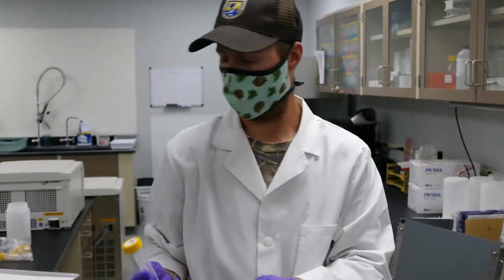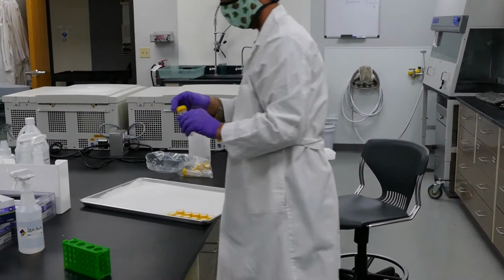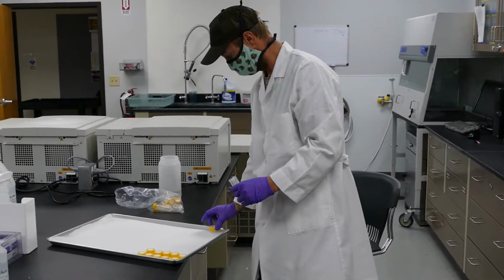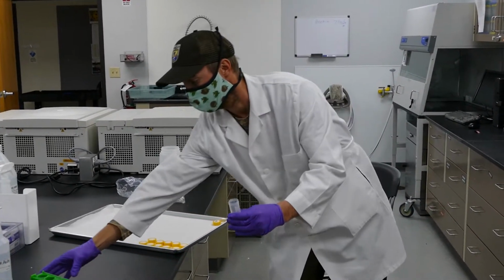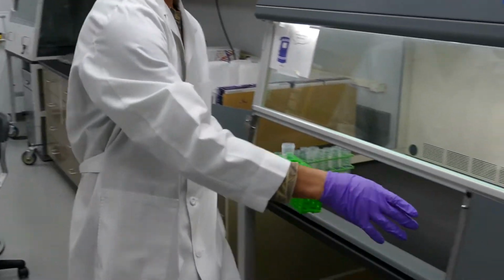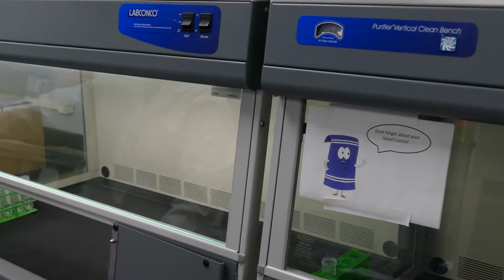It is very important to ensure complete evaporation. Both ethanol and isopropanol are PCR inhibitors, but also equally important is to not let the dried samples sit too long at room temperature. With that being said, it is important to have your last sample of the week drying before noon on Thursday to ensure samples do not sit over the weekend.